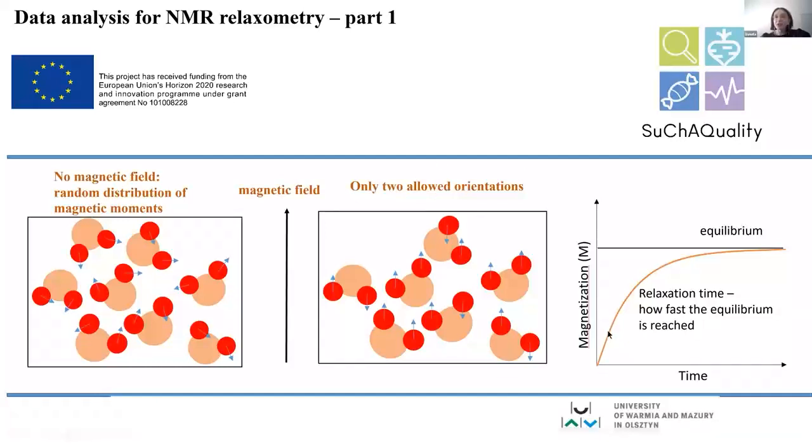And the process of reaching the equilibrium is called relaxation. It is like a term from maybe philosophy, yeah, one could say. That reaching equilibrium means relaxing. Yeah, one can apply it to different areas of our life. However, here it means that eventually the system repopulated and achieved the populations according to the Boltzmann distribution in the new, in this case, higher magnetic field.